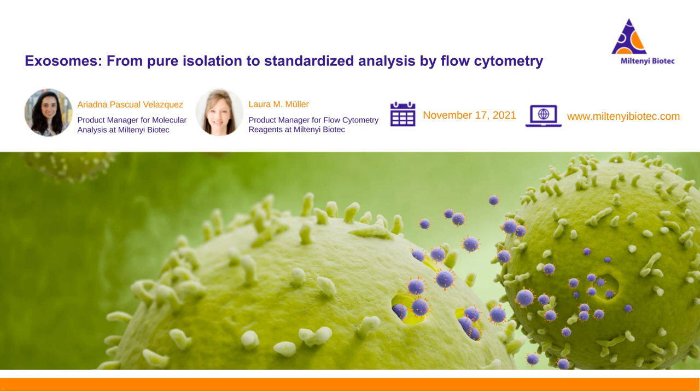Thank you very much. Our next question: LDL share the size of exosomes. Do you know if the LDL express CD9, CD81, or CD63? If this question is affirmative, how can we differentiate this particle?